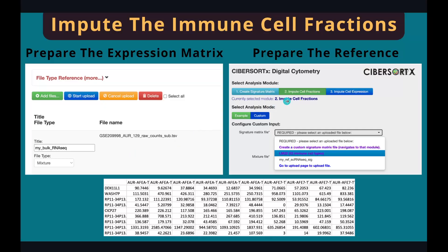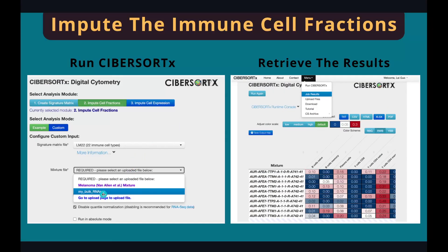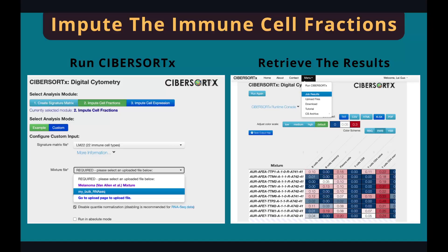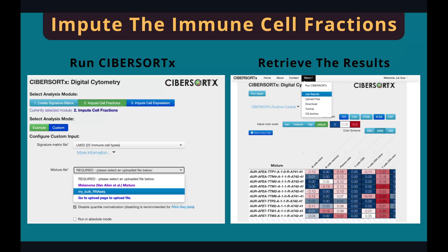Once uploading is done, click on Run CybersortX in the menu, go to that page, and click on the second step, Impute Cell Fractions, then click on Custom. There are two required fields: a signature matrix file and a mixture file. The mixture file is the RNA-seq data we just uploaded. The website has a built-in signature matrix file for immune cells called LM22, which contains 22 immune cell types. Select this one for our immune cell infiltration analysis, select our dataset as the mixture file, and hit Run at the bottom of the page. In a couple of minutes, the web page will bring you to a new result page showing the results of the deconvolution analysis. If not, just go to the menu and click on Job Results, which will lead you to the same page.